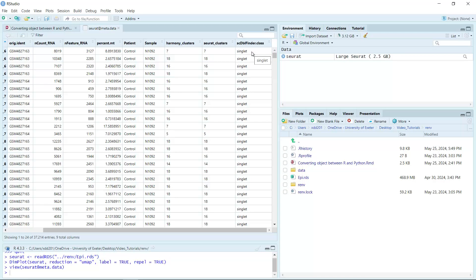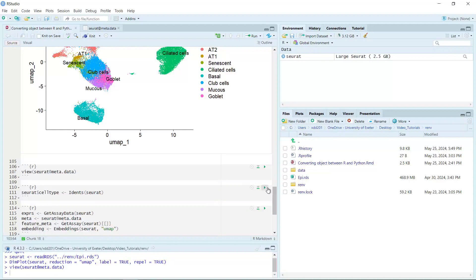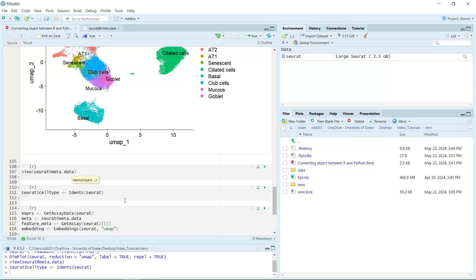I also removed doublets. You can see I named the cell clusters, but in the metadata I didn't add the cell type information. So next we can add the cell type information from the Seurat idents. Now we have added the cell type information in the Seurat metadata.